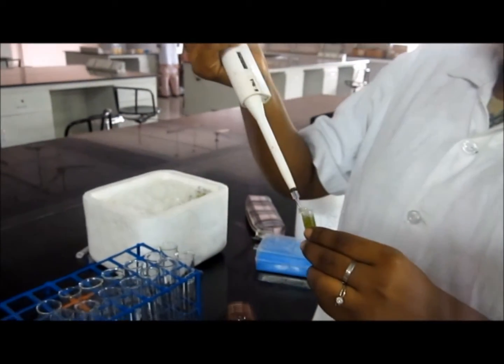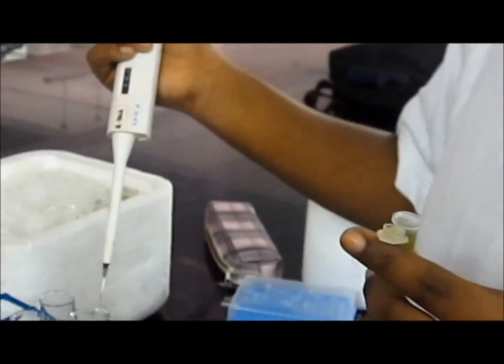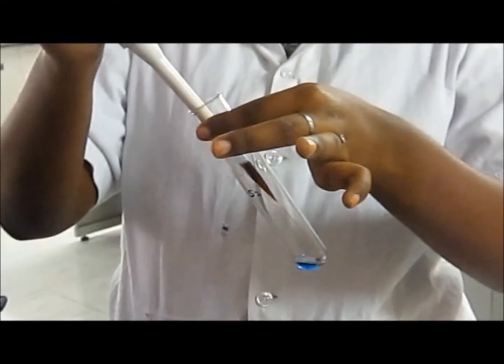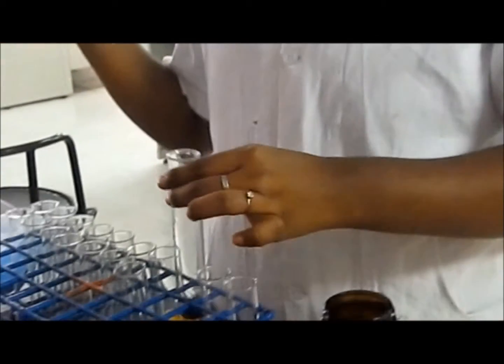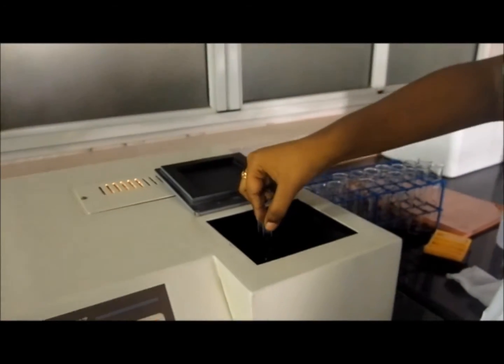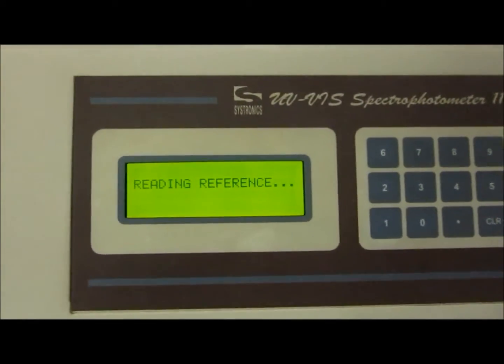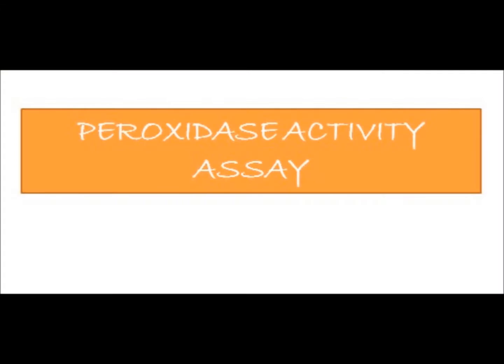Next is the Bradford test. The Bradford test is done to quantify the protein. The sample is taken in a test tube and 5 ml of Bradford reagent is added. Within 30 minutes, the readings are taken in the spectrophotometer at 595 nanometers. The proteins are quantified such that their concentration is 1 microgram per 1 ml.